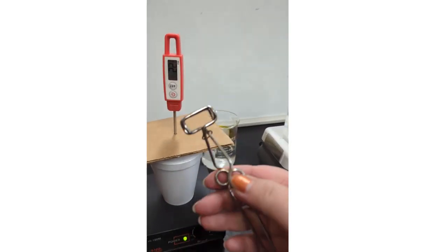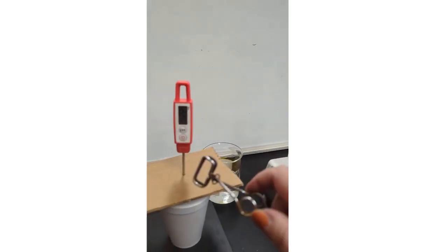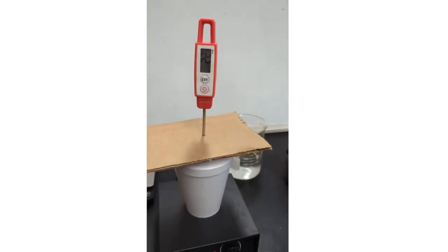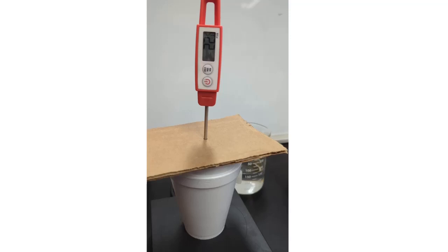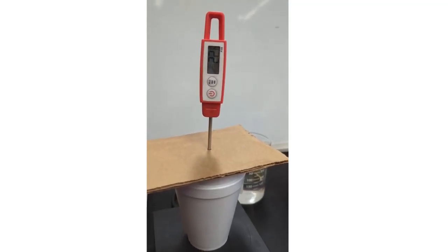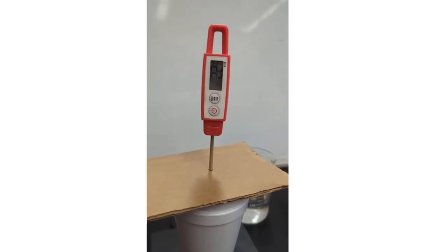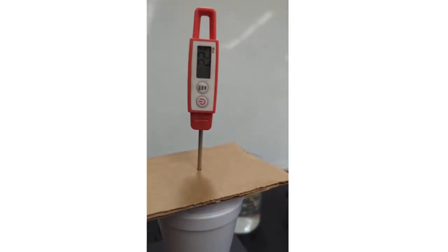And I'm gonna use my test tube clamps to grab the test tube, invert it very quickly into the calorimeter, slap the lid on top, and I'm using a cardboard lid here. Oh, it looks like our initial temperature is changing. We might have to change it in our data table. Yep, 22.0. Let's call that our initial temperature.